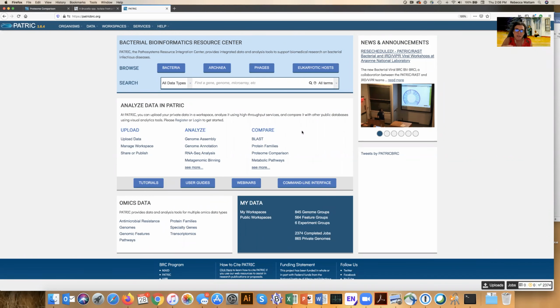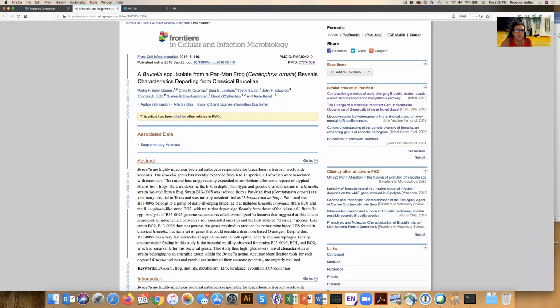In this video, I'm going to demonstrate how you can create a feature group and also get the FASTA file for the proteins within that group. This is something that we're going to be using in the Proteome Comparison tool, both as the reference and for the comparison. So I want to base this on this particular paper, which was published in 2016.